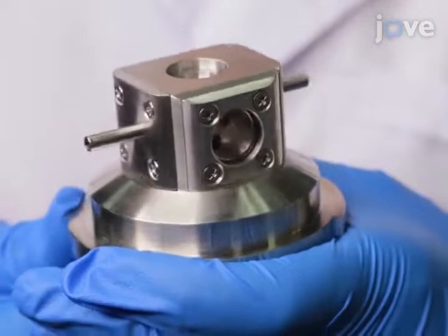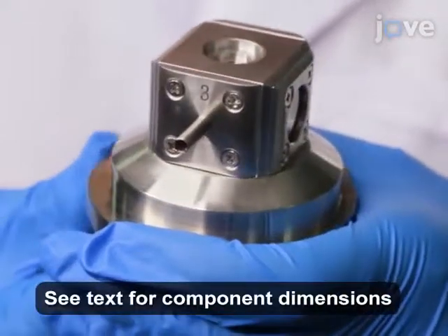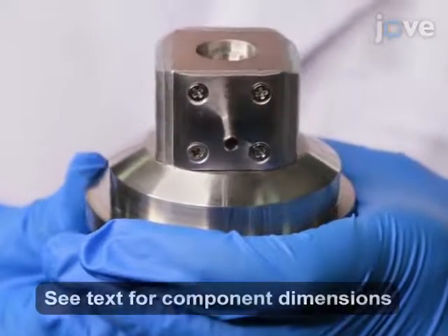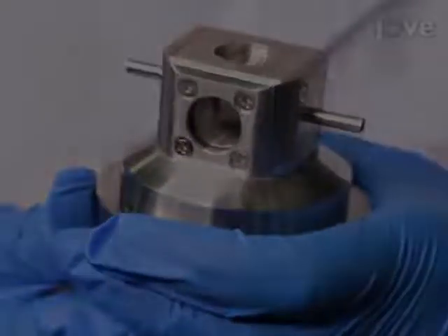Here, the secondary nano-ESI source is based on a commercial nano-ESI source and attached to a benchtop quadrupole Orbitrap mass spectrometer. The main body of the source is a cubic stainless steel chamber with an inlet to introduce the nano-ESI capillary into the chamber. Two stainless steel tubes are installed on each side of the chamber for gas delivery.